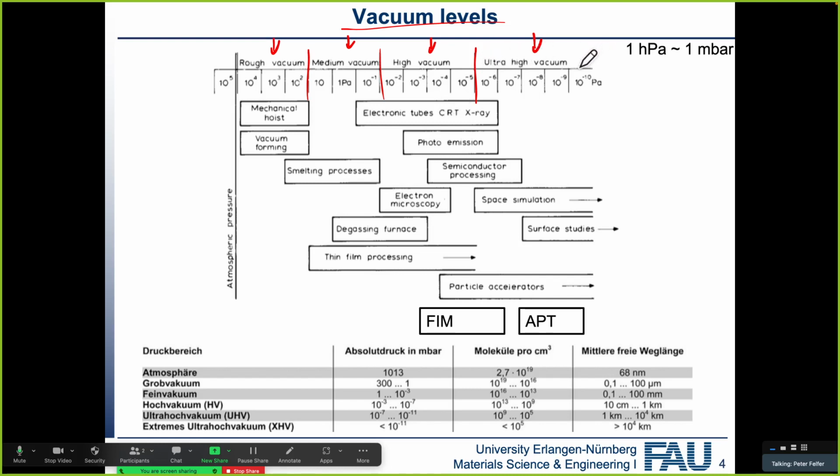And then we have ultra-high vacuum systems, and ultra-high vacuum means we usually have ion pumps or sorption pumps. They're no longer pumps that get rid of the gases, but pumps that trap the gases. So some kind of sorption pumps plus a bakeable system. The system is more or less sealed from the outside, because we can't use any regular seals that would allow for any motion.